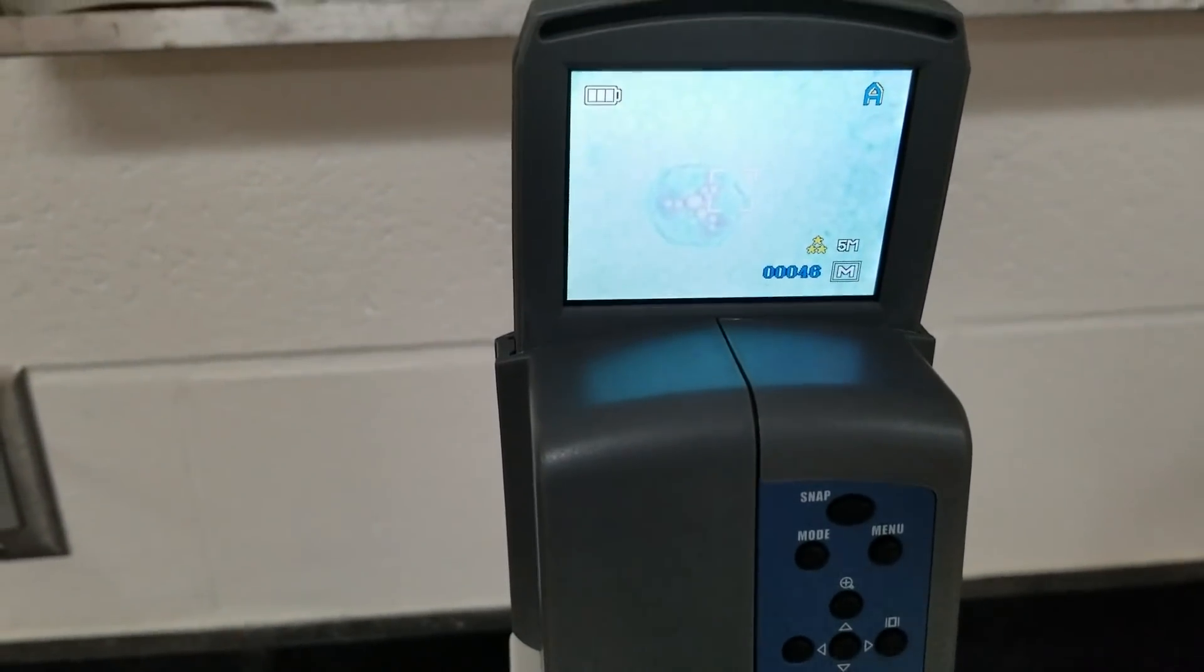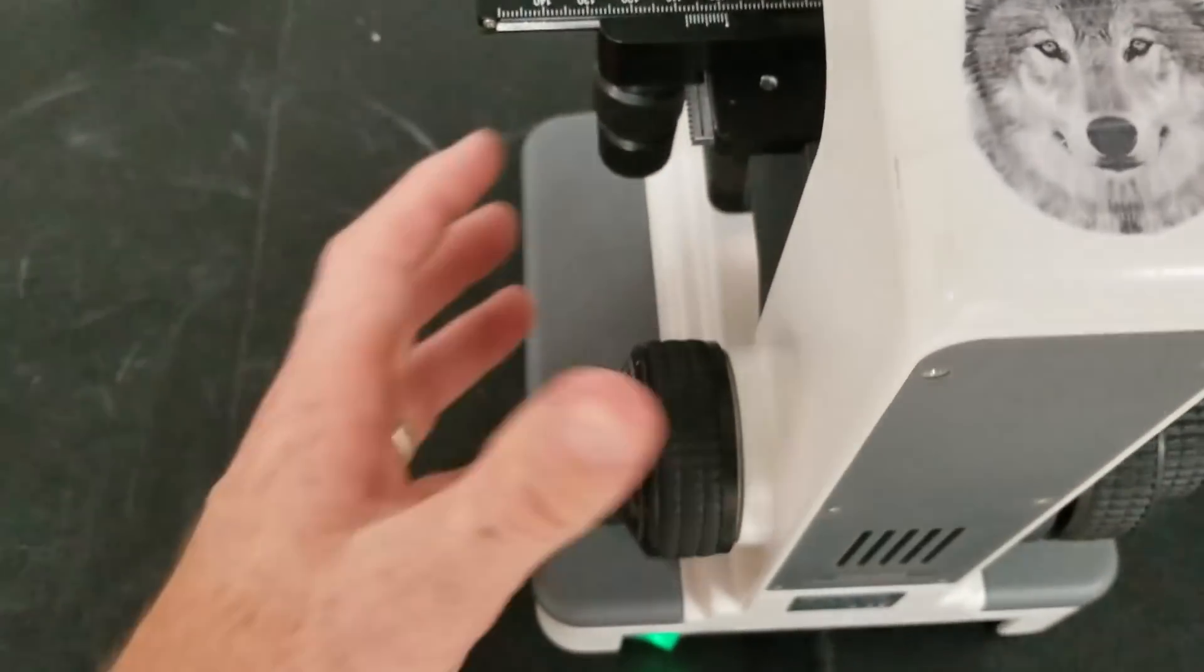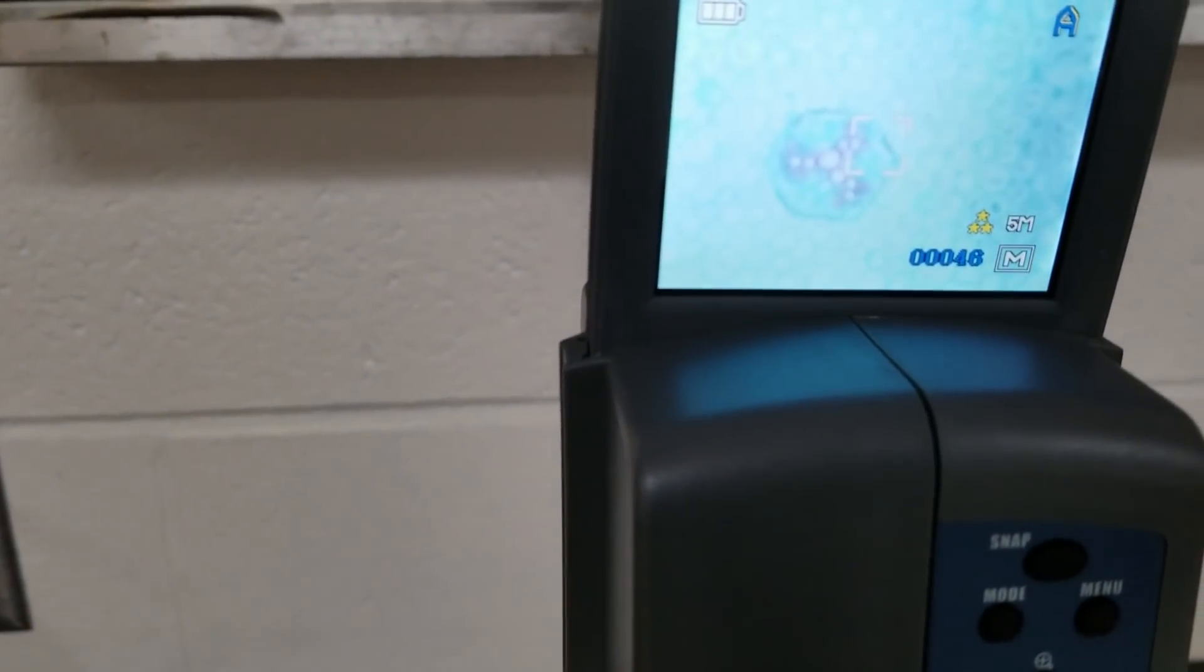Make sure this is on again. You're going to have to readjust. We're still good. We're still centered. I still need to adjust this. So I'm going to move the coarse adjustment until it becomes clear or clearish. There we go. That was good.